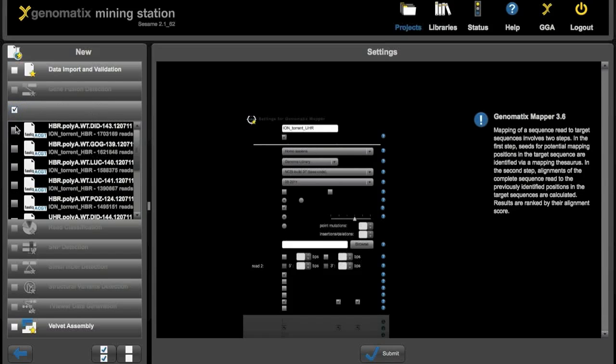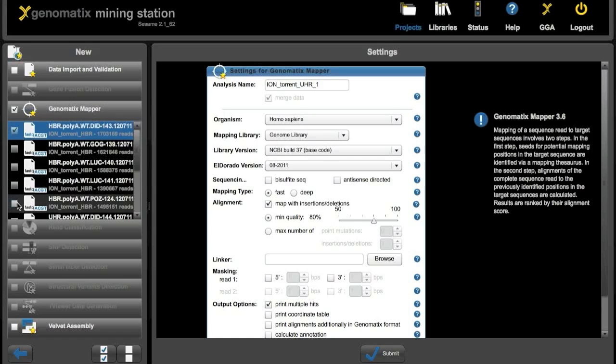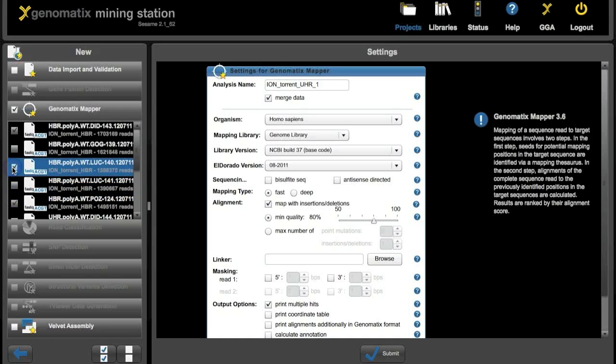Now let's start an alignment on these again. Again we choose the genematics mapper. And now we have to select those five files that we want for the analysis, the HBR files.